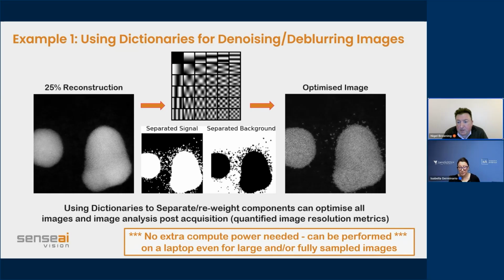Yeah, so if you think about a STEM image, you're acquiring the pixels sequentially, and we're missing out pixels. But let's say you take a TEM image, which acquires all the pixels simultaneously, but you turn the dose down to the point where there isn't scattering into all of the pixels. You've effectively subsampled the TEM image in that process. And so that means that a lot of the in-painting will work in the same way on a very low dose TEM image. And you can in-paint the missing information using exactly the same algorithm for low dose.